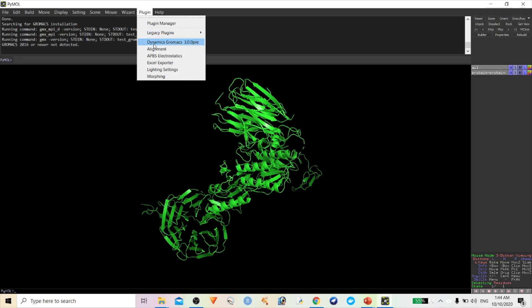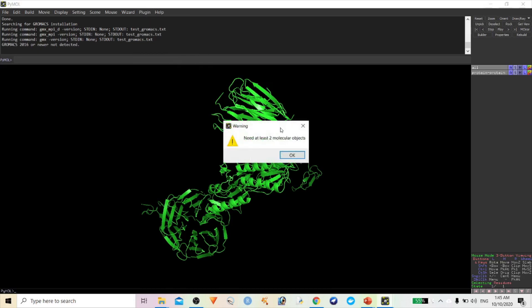Most of the dynamics Gromacs plugins don't work in Windows — they will definitely work with Linux. If you have properly installed Gromacs in Linux, it will automatically work for you.